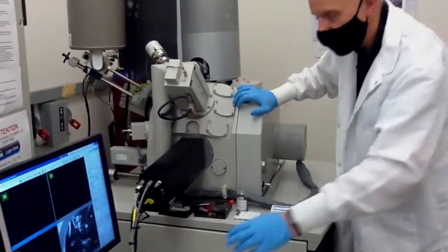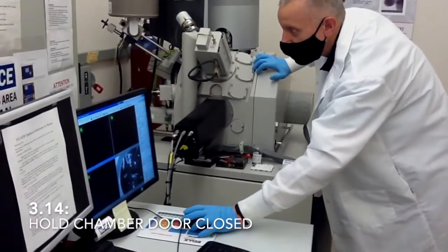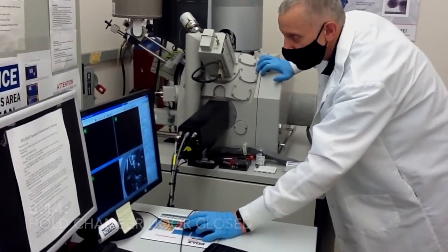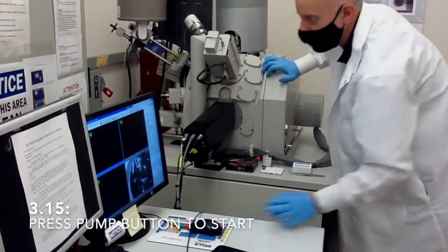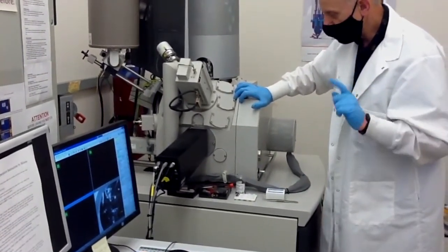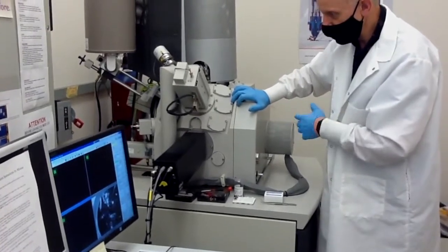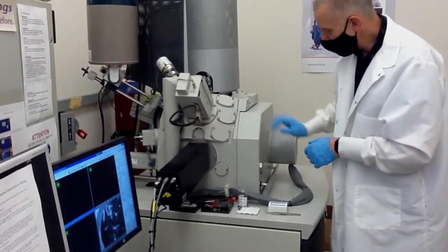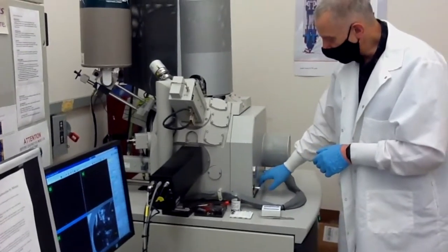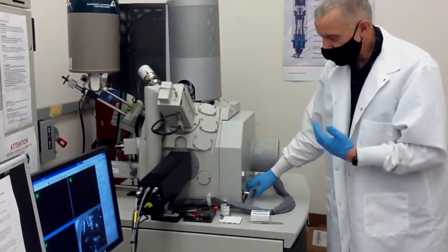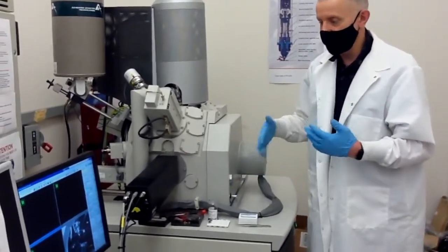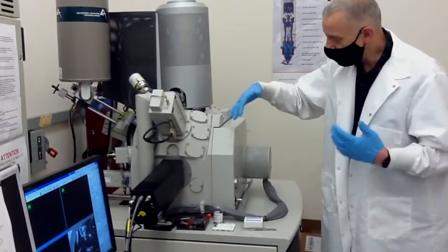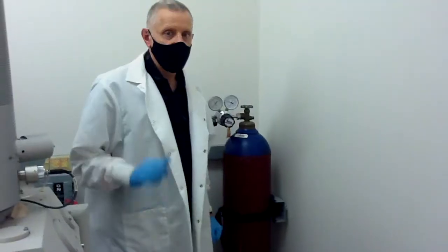So before you press the pump button, make sure that you hold the door initially just for a few seconds. And then start pumping. You should hear the valve closing and the system should start pumping. After a few seconds, the door is already tightly closed. You cannot open it anymore. And the pumping process has started.